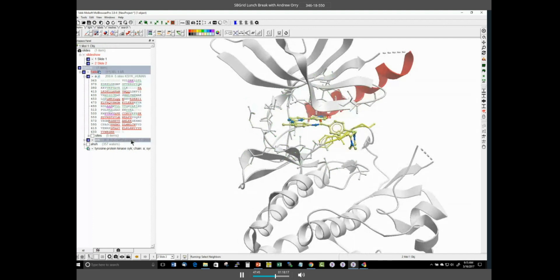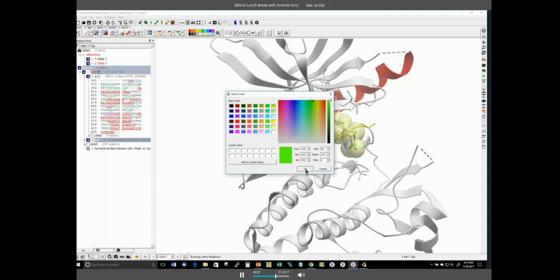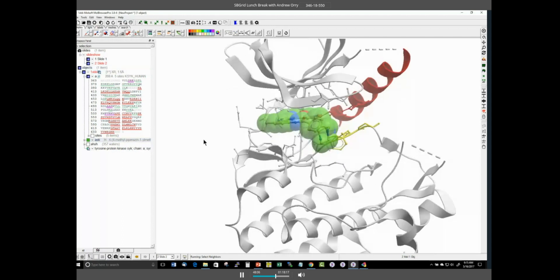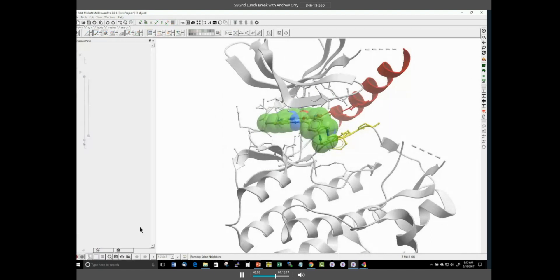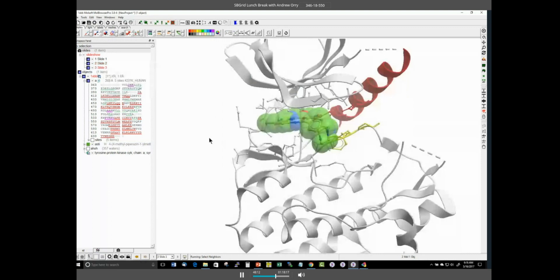To change the representation of the ligand, double-click on it in the ICM workspace. When we press CPK the ligand will be displayed in that representation. We can also change the color of carbons by clicking and holding the button and choosing 'Color C Only' then selecting carbon. We make another slide and can now toggle through the different slides we've produced.